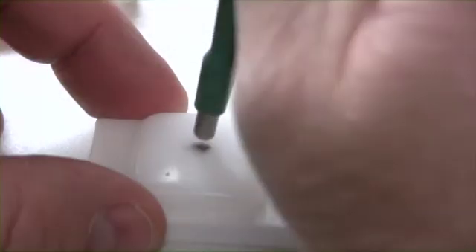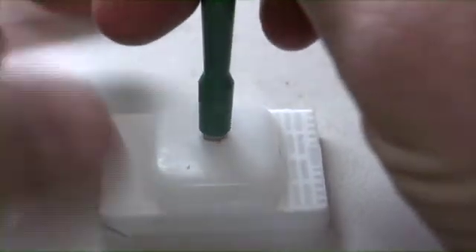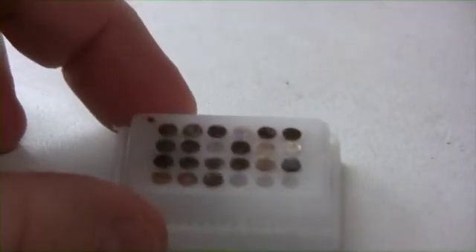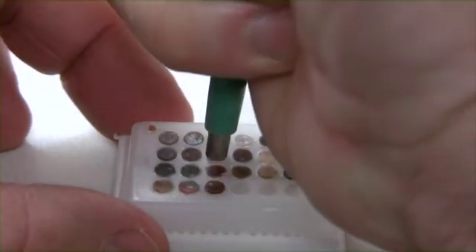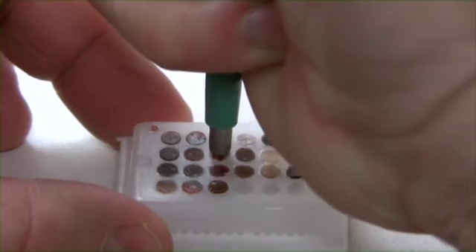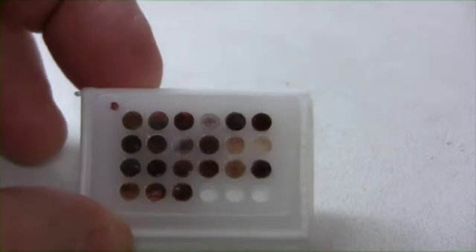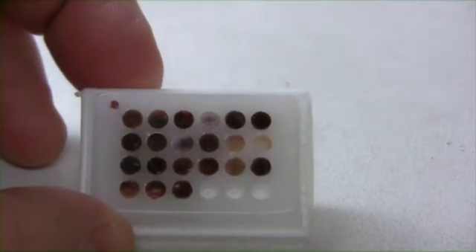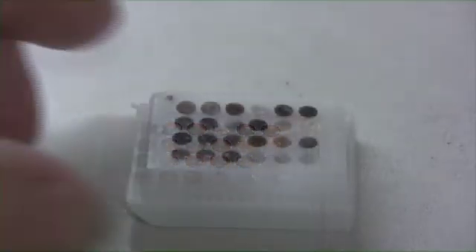Now I am punching the perpendicular embedded tissue. The cardboard stayed in the needle this time, so I will use it again as a barrier.